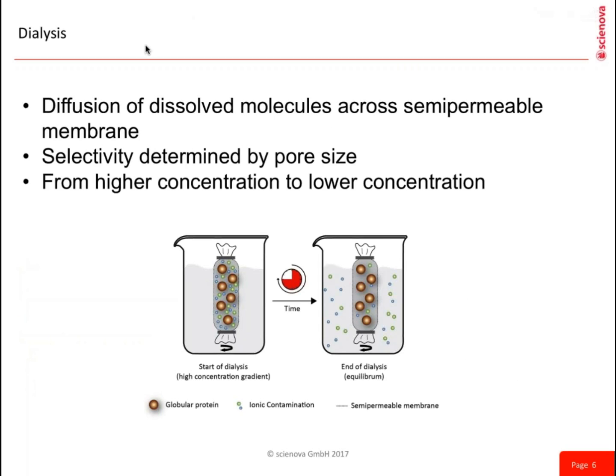The third one I want to talk about is the dialysis. Dialysis is the diffusion of dissolved molecules across a semi-permeable membrane. The selectivity is determined by the pore size of the membrane, and the diffusion in dialysis occurs from a higher concentration to the lower concentration of the sample and the buffer.